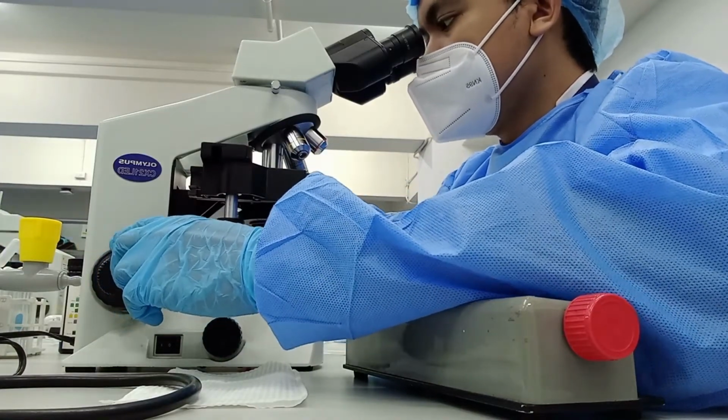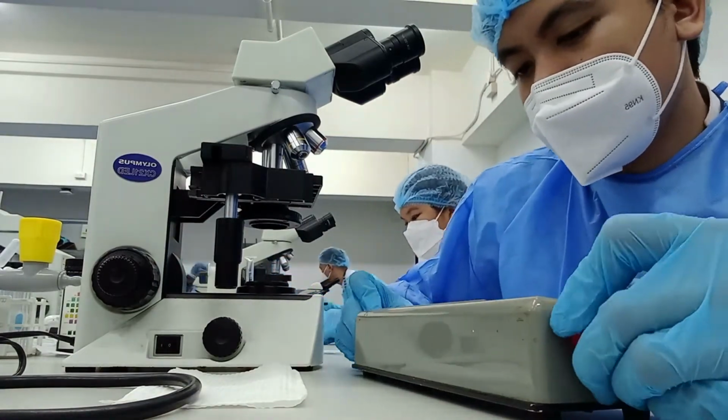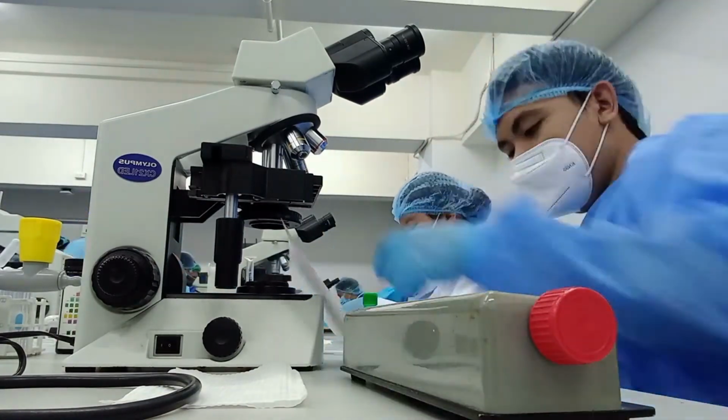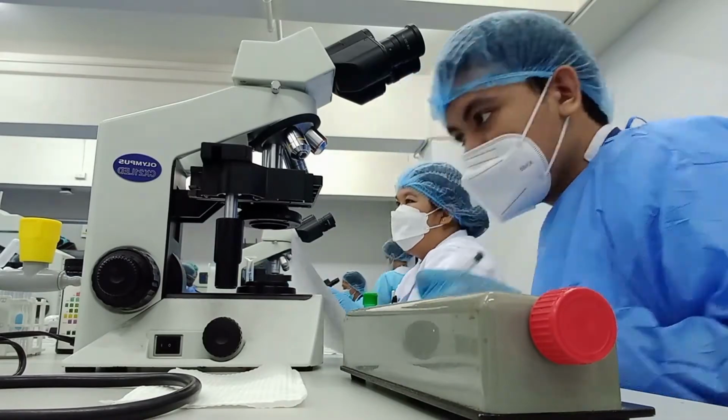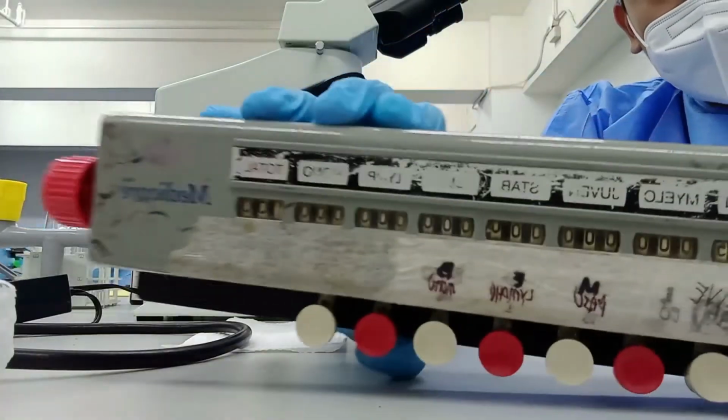While for the sperm morphology, it has been identified that there are 65% normal sperm cells and 35% abnormal sperm cells. Notable characteristics of observed sperm cells are double head, pinhead, double tail, coiled tail, and spermatid.